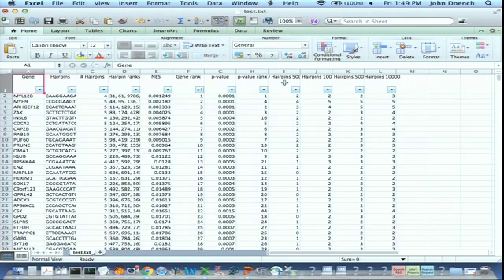Okay, so now you have a gene rank. If your screen was really just one final list of numbers, then this is more or less your hit list. Now you could go back and try it with, instead of weighted sum, second best. Now the genes will line up very nicely when you do that. If you had multiple different conditions, or let's say you did the screen in multiple different cell lines, you'll get a gene list from cell line 1, a gene list from cell line 2, and then either use an AND operator and take something that's scored in all cell lines, or take the OR operator and take something that's scored in any cell line.